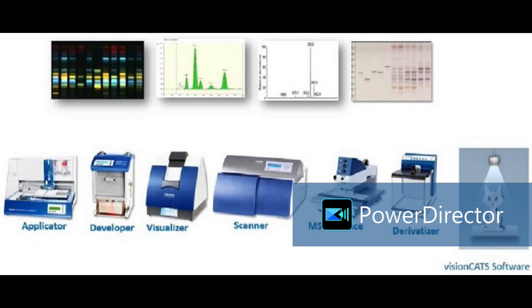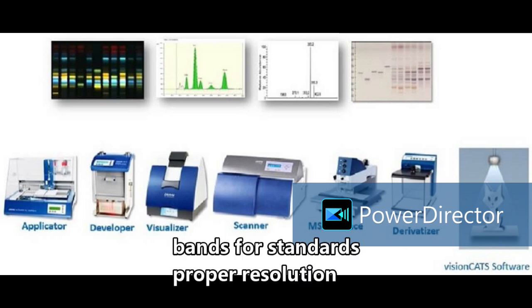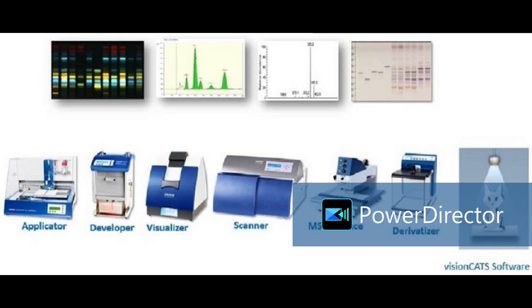Are these bands proportional to the amount of concentration we applied initially? Yes, yes. Here we need to load a known amount of standard along with our sample to quantitate the amount of that particular standard in the sample. So the width of the band is equal to the concentration? Yes, yes. The scanner of the HPTLC system will generate a peak response for the band, and that peak area is proportional to the amount of the separated analyte. You said visualizer or scanner? Scanner.